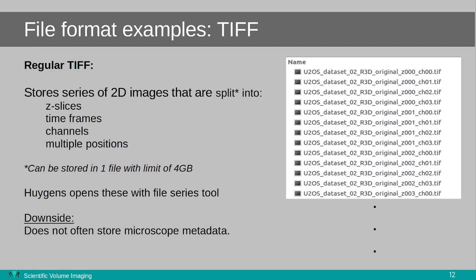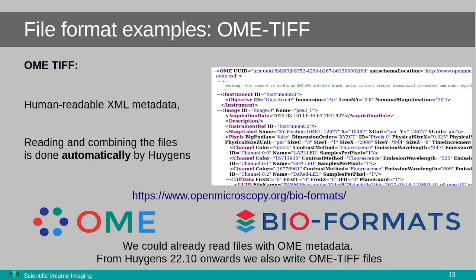An example of an initiative that aims to standardize the reading and writing of metadata on top of TIFFs is the Bioformats tool, developed by the Open Microscopy Environment Consortium. They also developed the OME-TIFF file format.